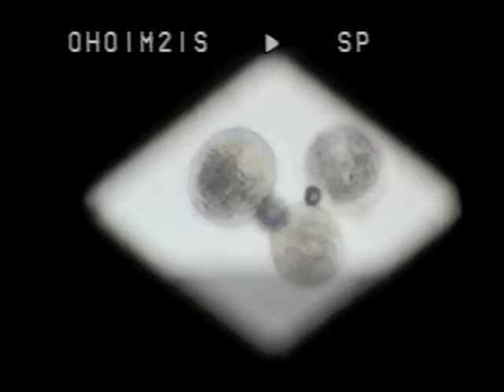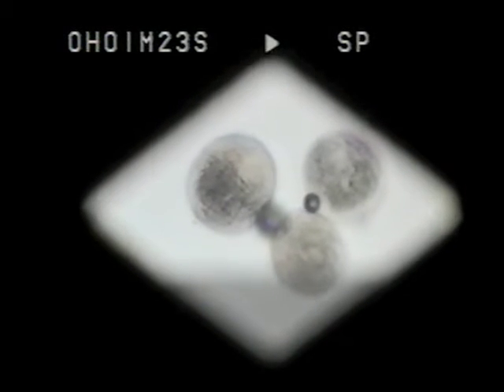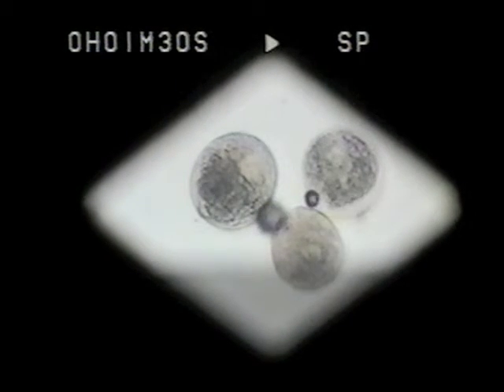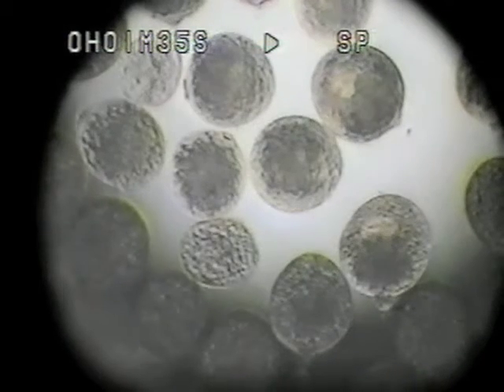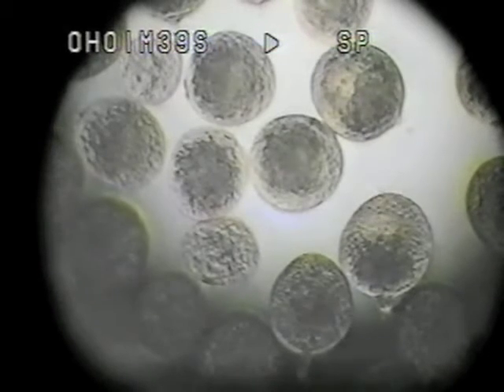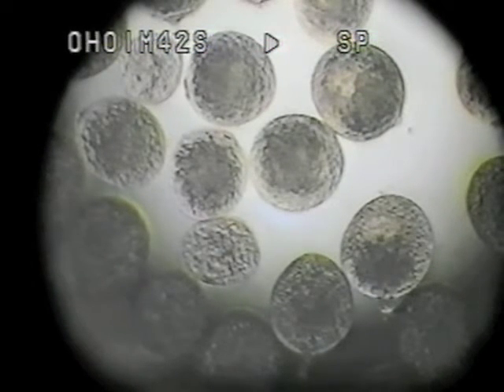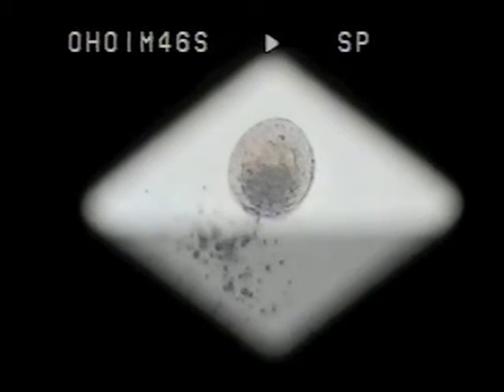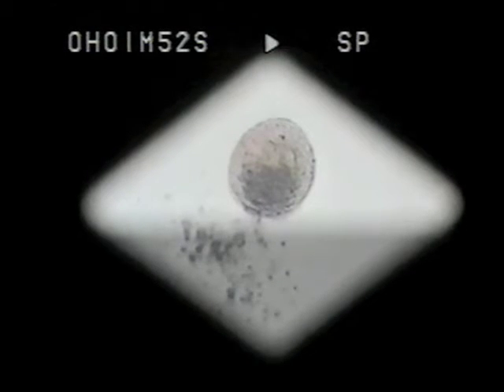Now you can see how the granules are coming to one end of the pollen grain. This shows the pollen very well, and the granules — as I focus up and down — are queuing up. Do you see this one on the corner here? It's just queuing up, and it will burst shortly. Now there is the first pollen burst — you can see the granules coming out, and the time is 3 minutes 51 seconds.